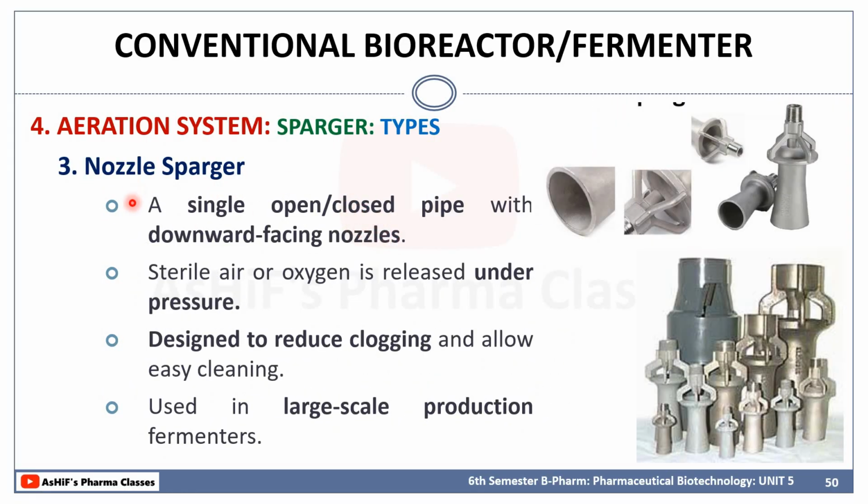Now coming to the nozzle sparger, it is very much the same as the sprinklers or nozzles we use in gardens. They are the same type of sprayers used for watering in gardens. It's a single open or closed pipe with a downward forcing nozzle. So the sterile air or oxygen is released under pressure, and it is usually designed to reduce the clogging of the first one.